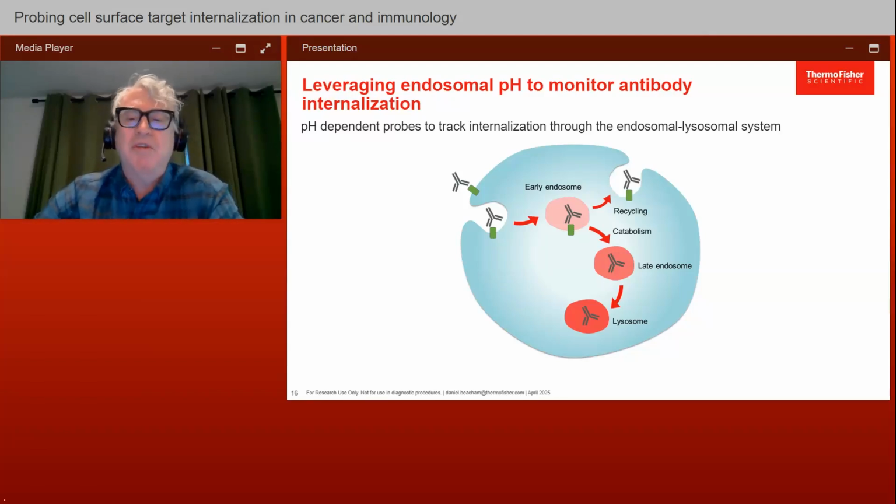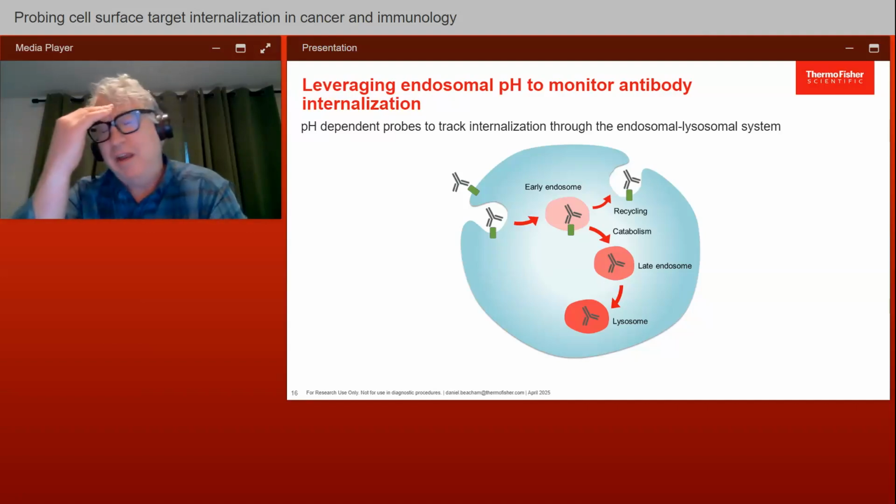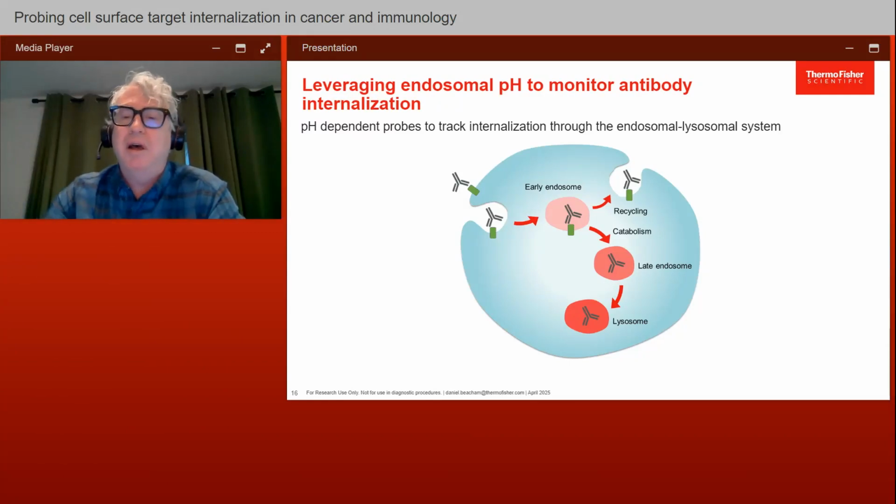It's a very dynamic process, on the order of minutes, tens of minutes to hours. And so this is the other piece, and that's really why we've used these on-stage incubator devices, because you either miss things early on, or you have to wait for an overnight event to get full internalization and trafficking. So being able to visualize constantly and know where things are winds up being pretty key with understanding the rates that a different antibody may internalize the same receptor, for instance.